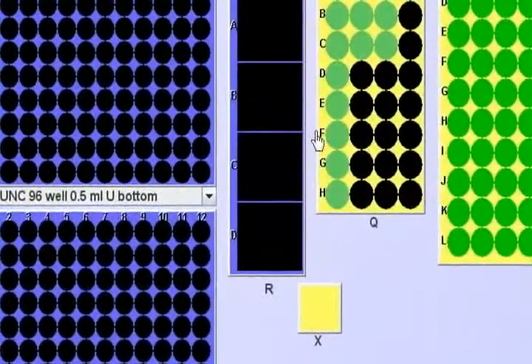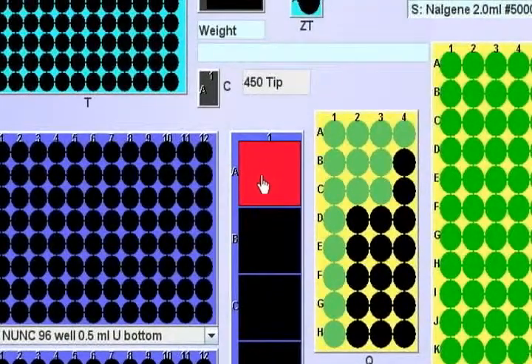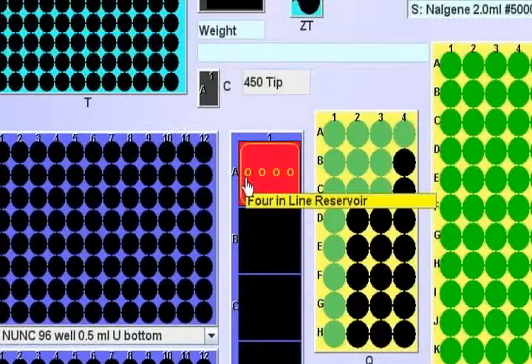Reservoir RA1 can be fitted with a removable plug. This plug will hold 4 2 ml vials, providing a capacity of 8 ml. By right-clicking the reservoir location, it will convert that reservoir to the 4-vial format. The vials must be opened manually.